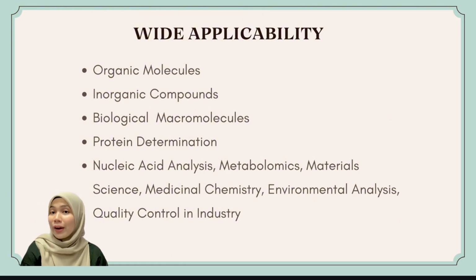In the realm of biology, NMR serves as a powerful tool for unraveling the three-dimensional structures, dynamics, and interactions of large biological macromolecules such as proteins, nucleic acids, and carbohydrates. Its widespread use extends to structural biology, where NMR is employed to determine the structures of proteins in solution, which can aid in understanding their functions, folding pathways, and interactions with ligands.